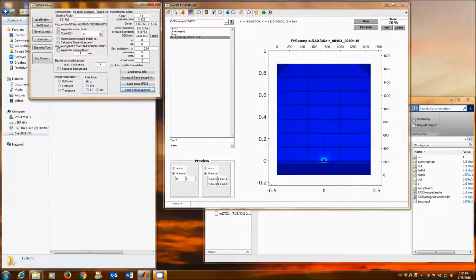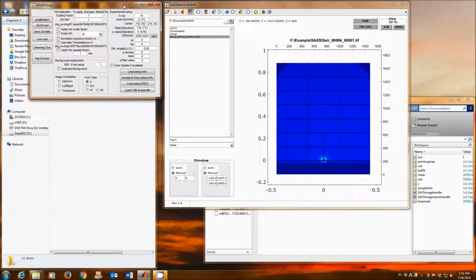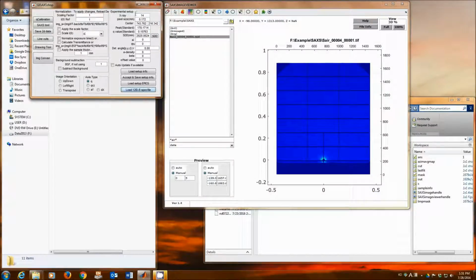if you have all the images ready to go, then the first step we need to do is choosing the spec file, okay, by clicking the 12ID spec file. So in particular, for this set of data, this file was the spec file, okay. So I select that one.